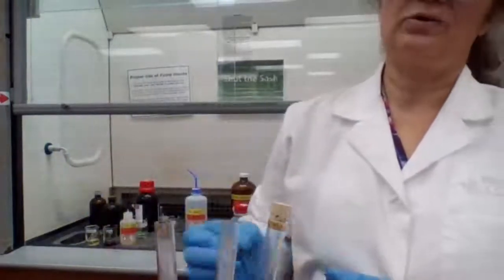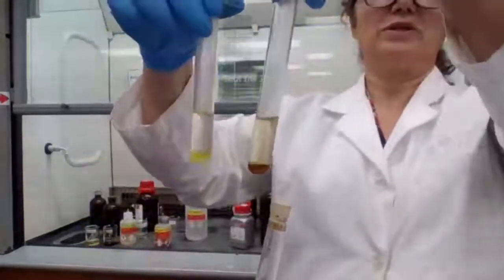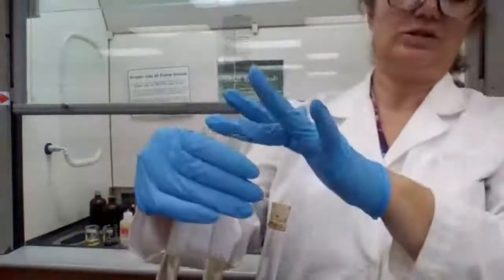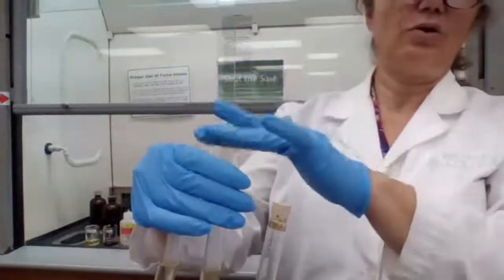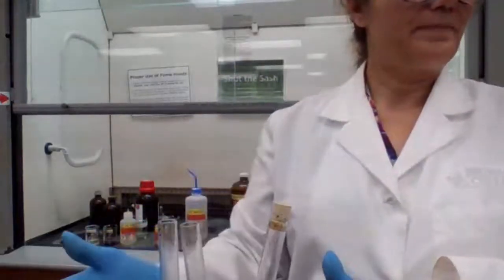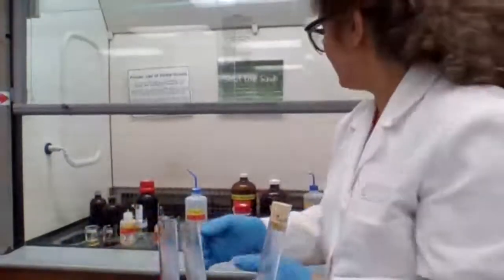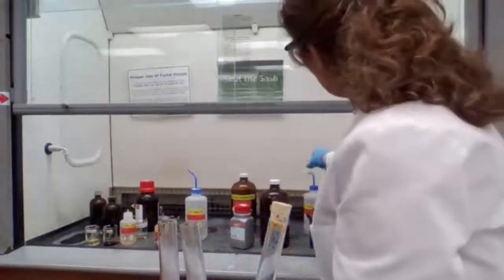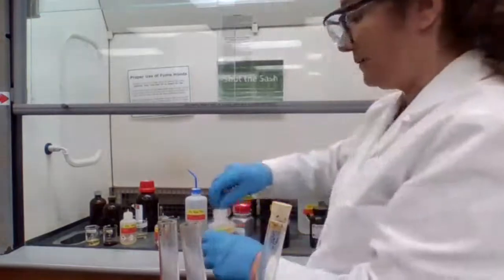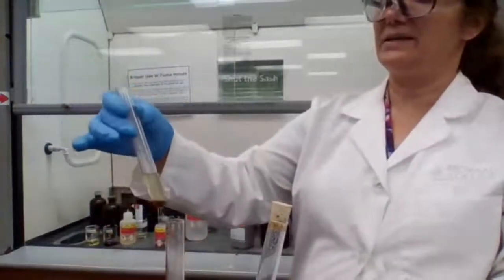Two layers. But we want to confirm, in case it's an unknown, because they both behave the same, didn't go to solution for secondary and tertiary, then we have to do one more step to discriminate between these two, to see is it secondary or is it tertiary. And how do we confirm it? Add 10% HCl, very good. We have the 5%. Okay, we have 10% HCl. We want to add 10% HCl until it's acidic.